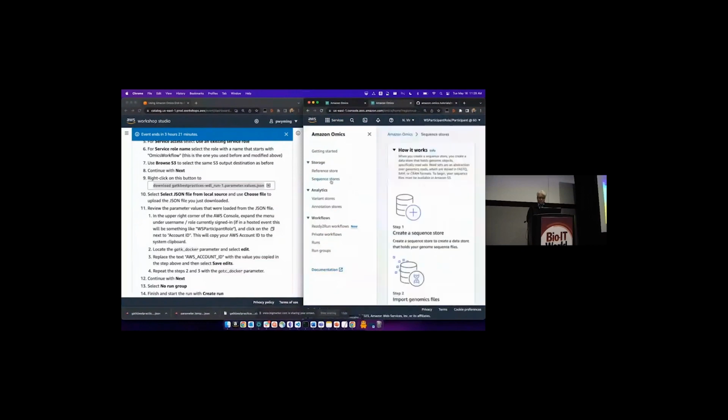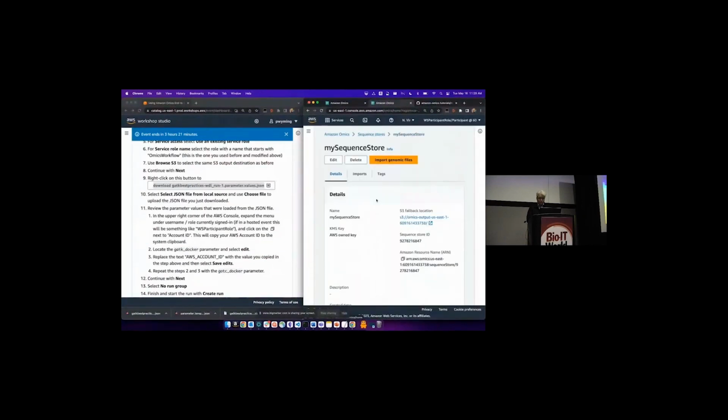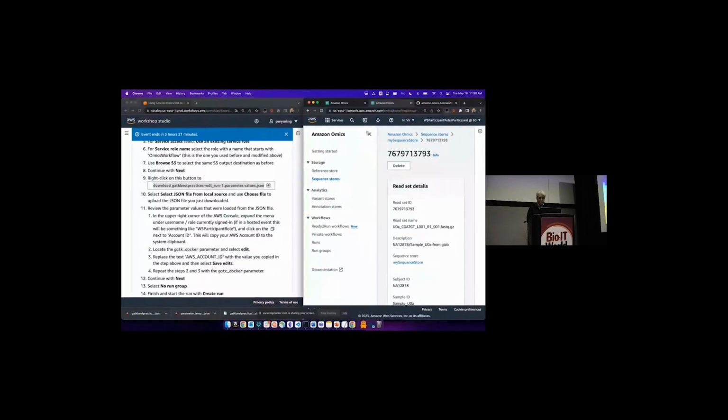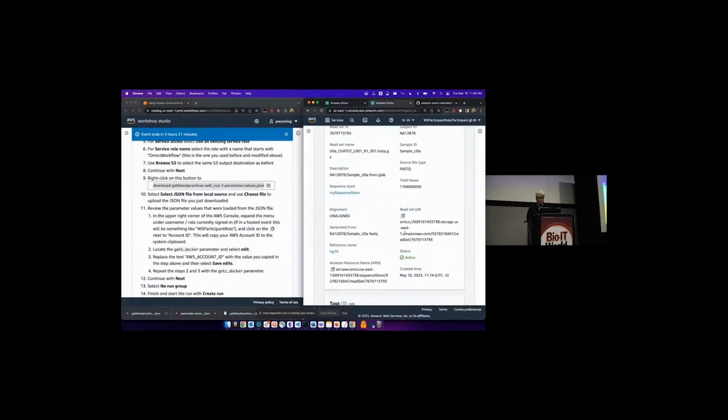So I'm going to go back to my sequence store, and I'm going to find the FASTQ that I uploaded or imported before. So it's this guy here. And then here's this URI. So I'm going to copy this read set URI, and things you'll note, again, this is your account ID, storage, US East, Amazon Omics, or Amazon AWS, sequence store ID, read set ID. That's the format of these Omics URIs.